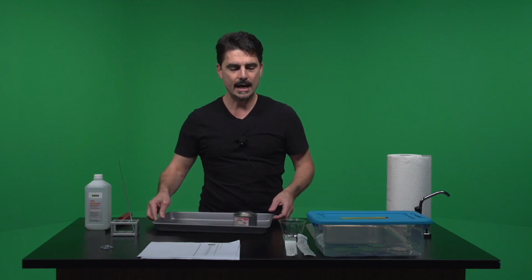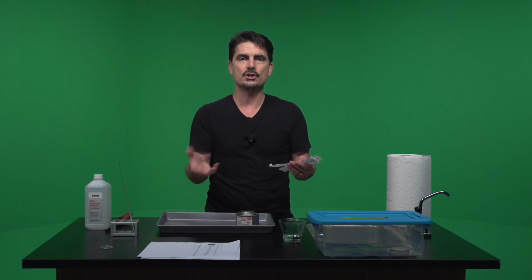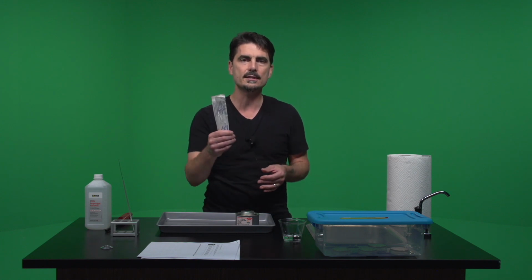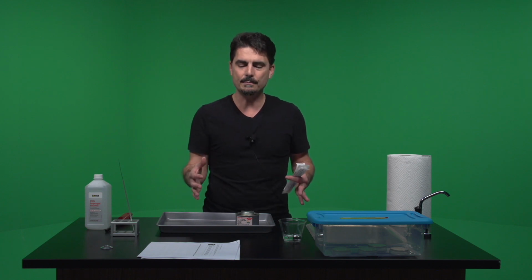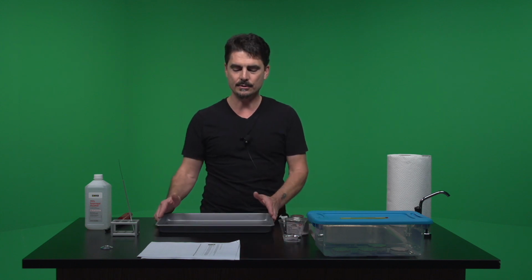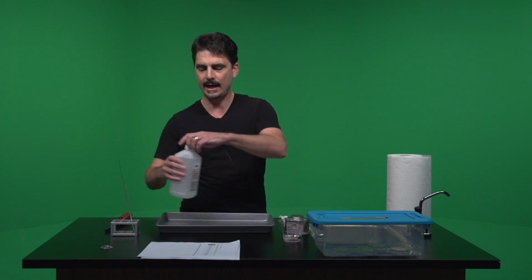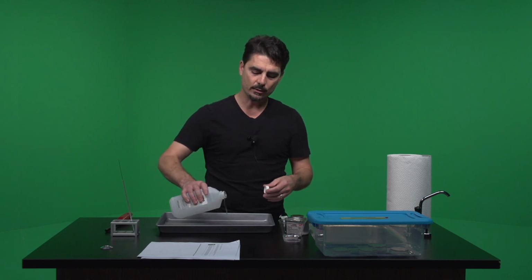And as far as cleanup today, actually since all of these, this swab for my nose is just like if I blew my nose, and every time we blow our nose we just throw that in the garbage. So I can throw these in the regular garbage, right? Again, this is a lab where we haven't grown anything up yet, so it's a little bit different. However, one thing I do like to do just as a course of practice is every time I'm done with my tray to make sure that I go ahead and clean it. And in this case, we don't need the Clorox bleach because again, we did not use bacteria that we grew on the plates.